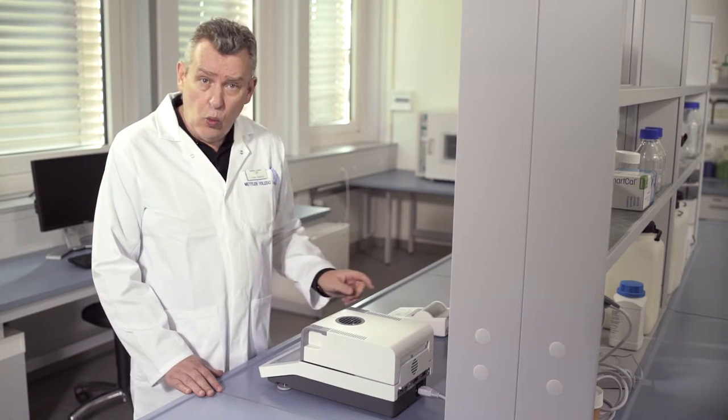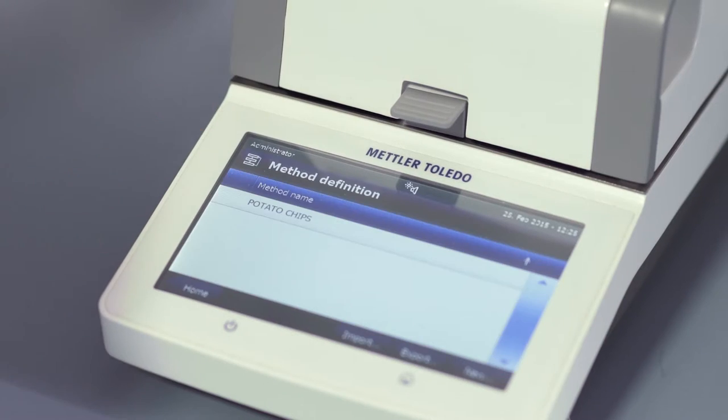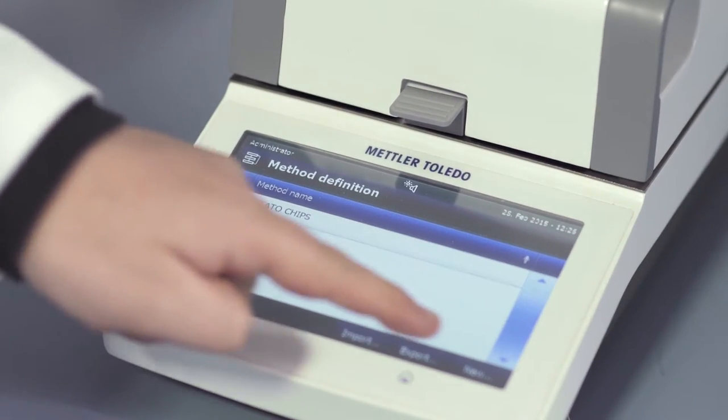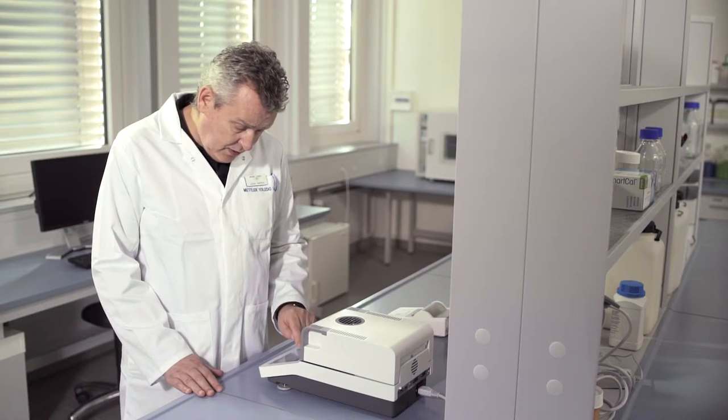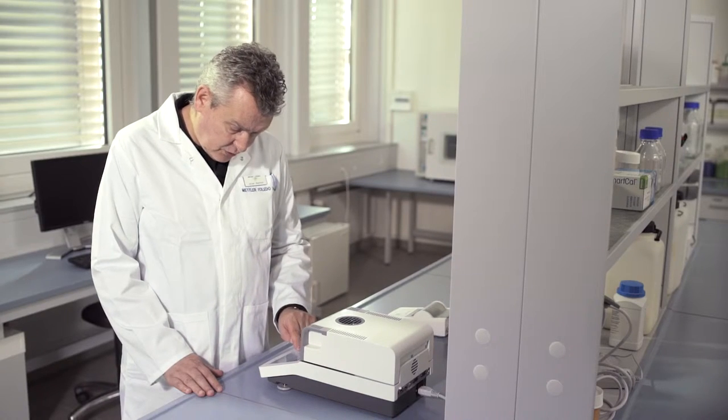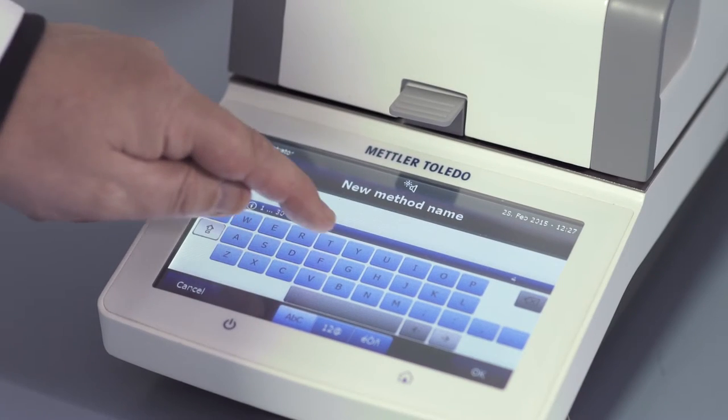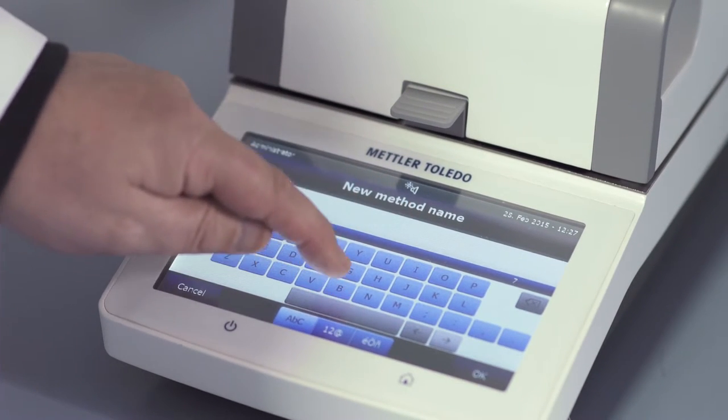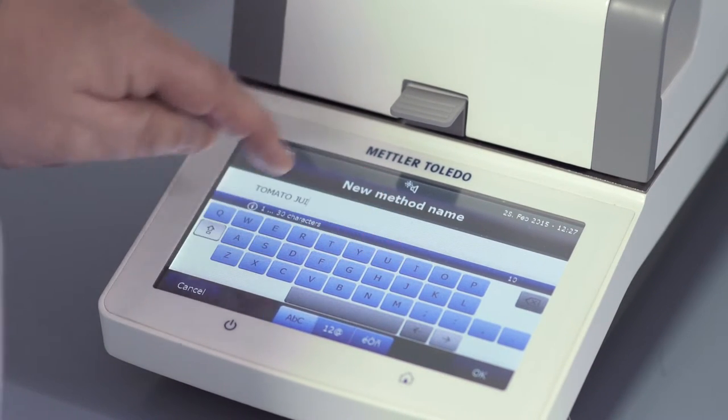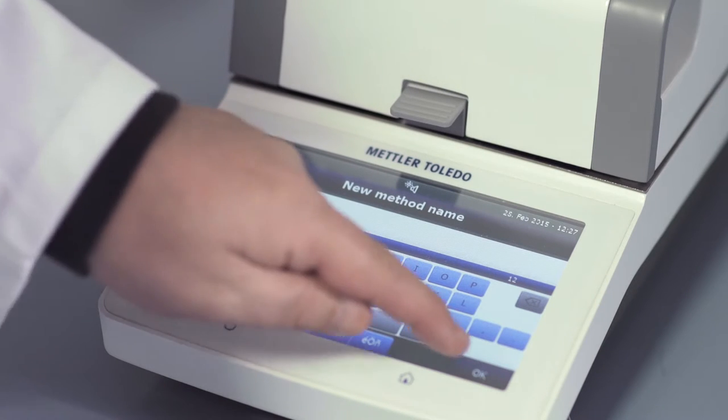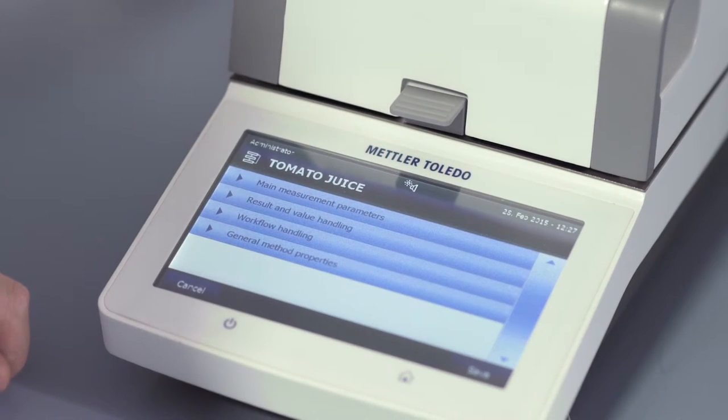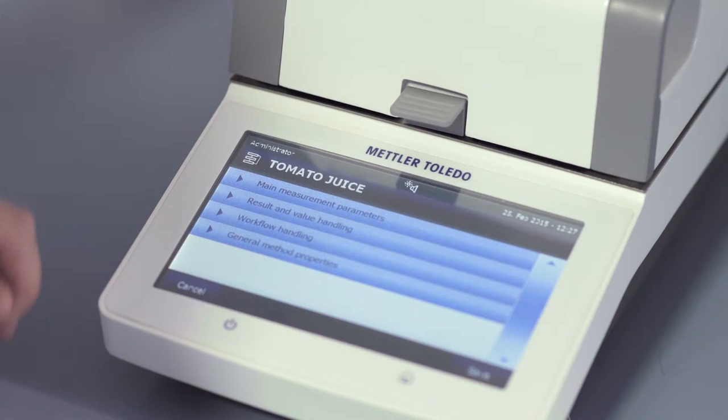As before, we press method definition, new, we type in the name tomato juice, and now we can define the method parameters.